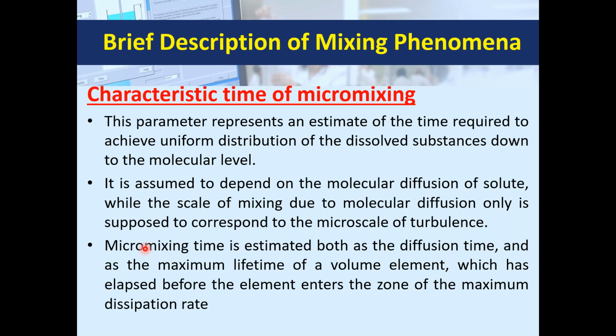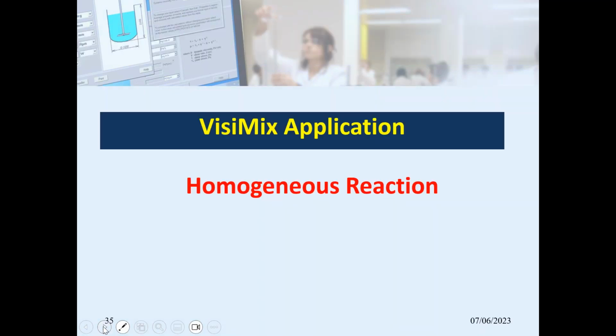We have, of course, complete theories about turbulence, eddy size, energy dissipation, and cascade of energies. All of this we are taking into consideration. But in simple words, we are talking about these two main important parameters that we are using both inside the tank in order to evaluate the concentrations of our materials at the positions that will be important for the process. What we will see when we are calculating this kind of thing.